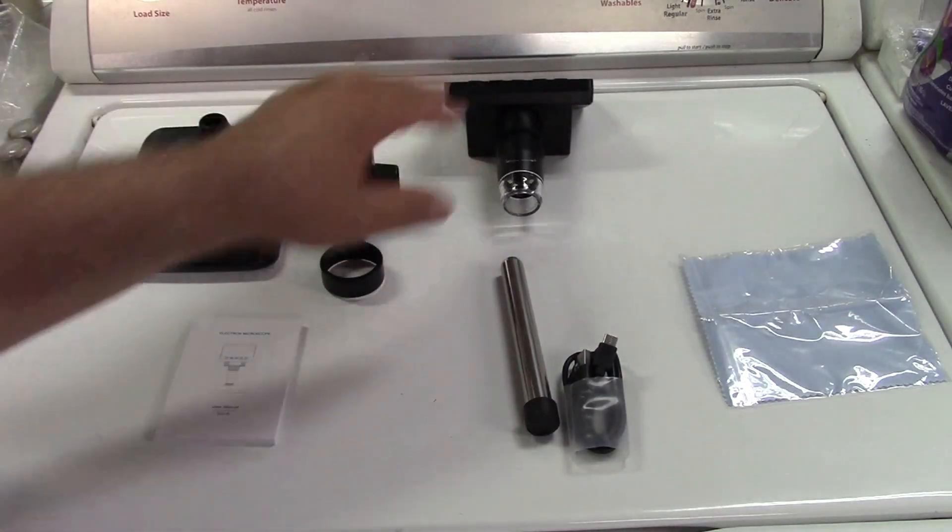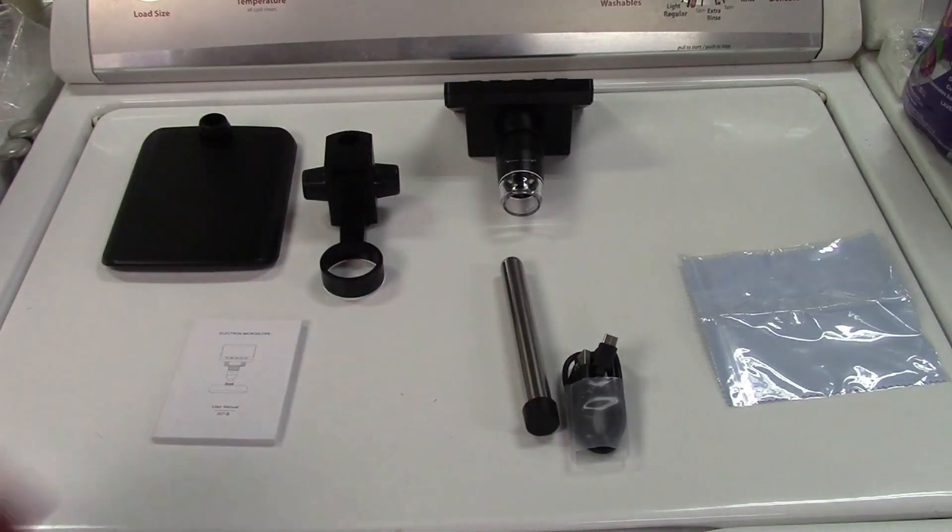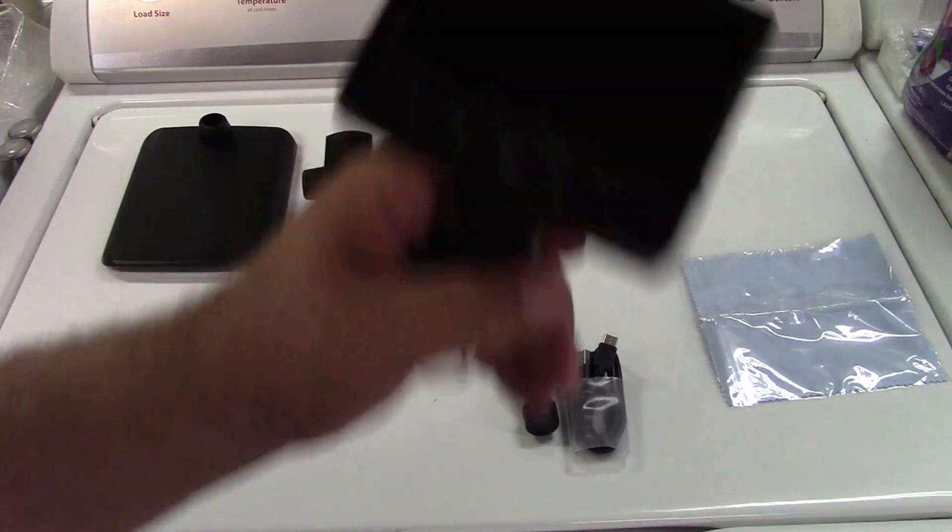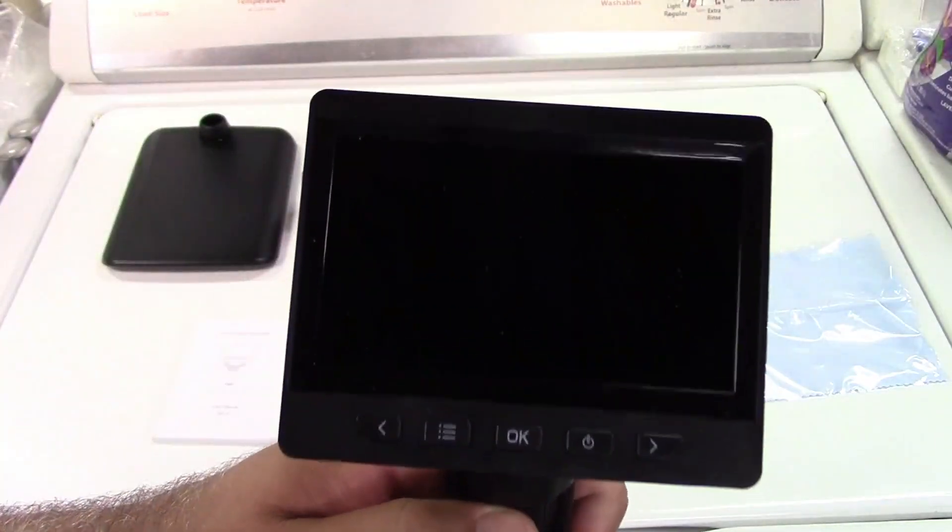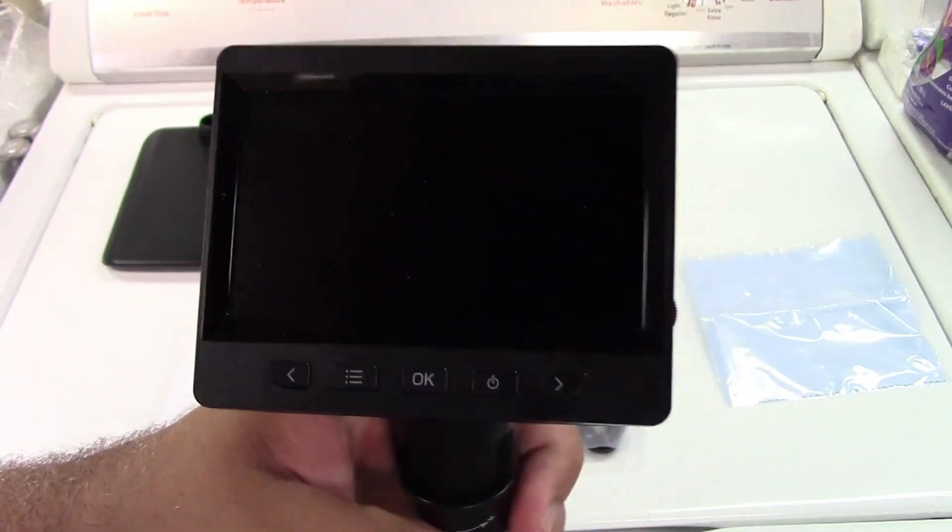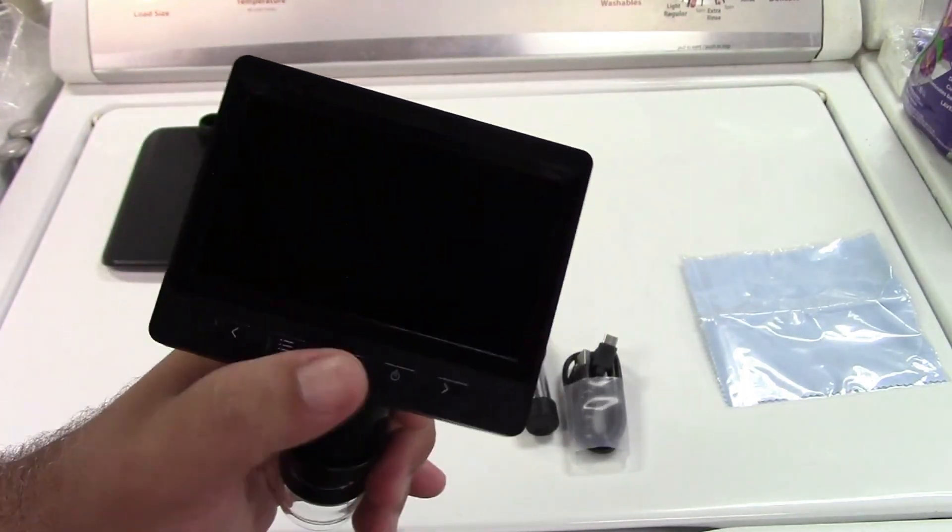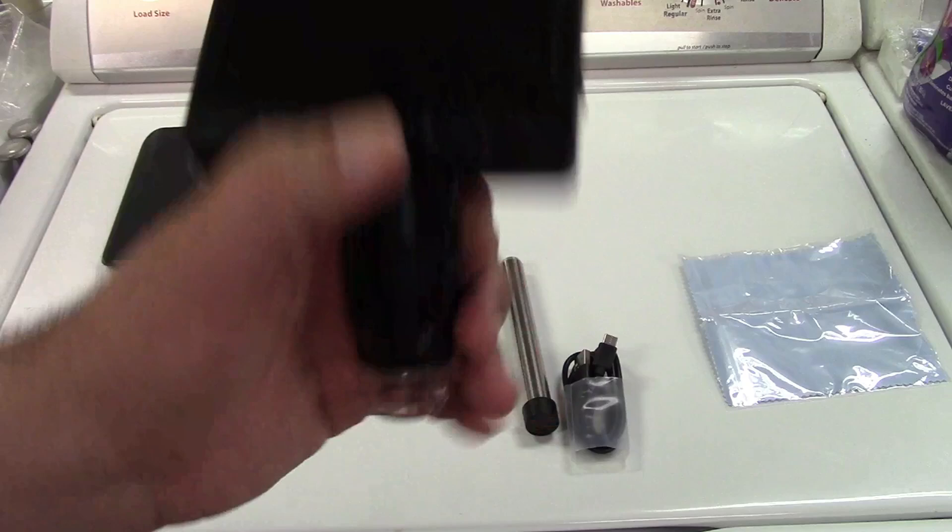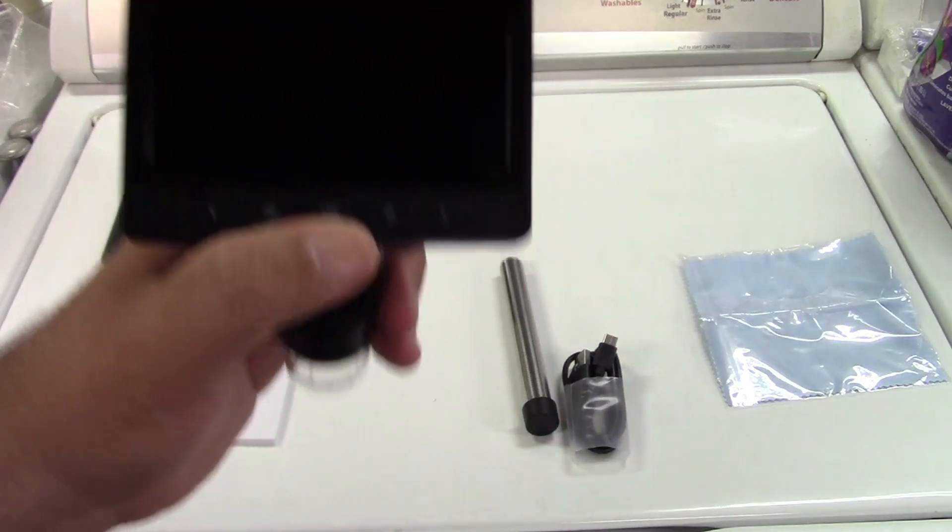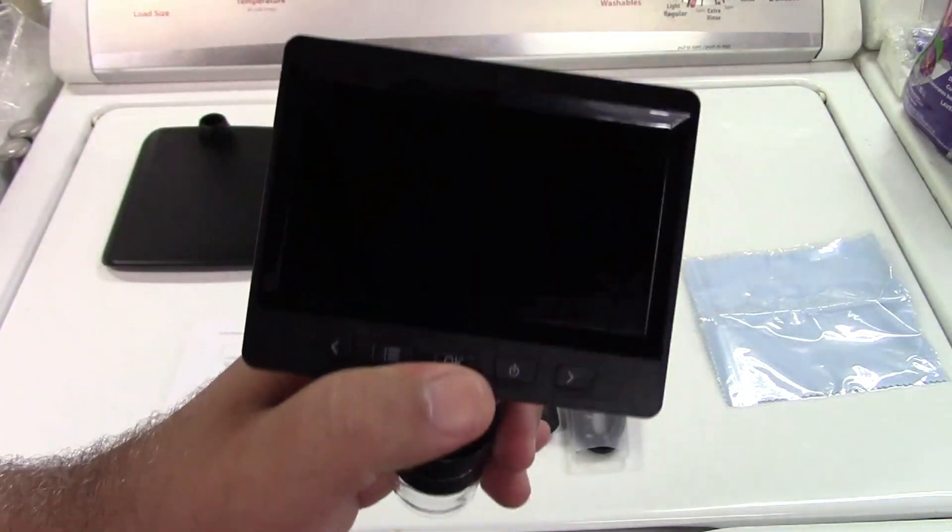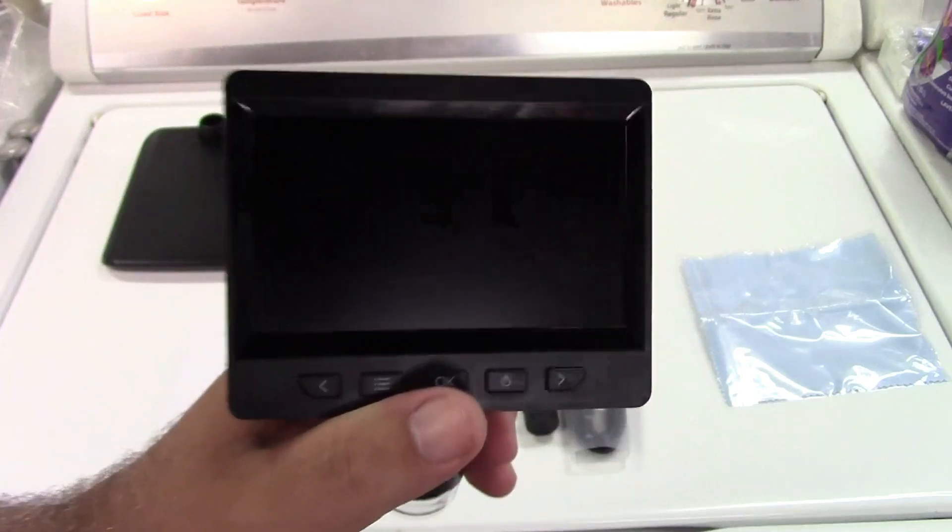This is a digital microscope, of course. It's got a 4.3 inch IPS type display for very clear images. This can record pictures as well as videos from what the scope sees. There is enough storage built into this for 100 photos but no videos.